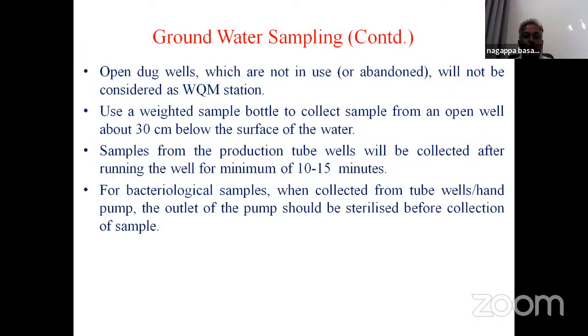Groundwater. If it is well water, a tube well, motor driven pump or hand pump in the village or community water supply, we have to switch on the pump for 10 to 15 minutes. We have to pump out the surface water in the borewell. After 15 minutes only, we have to collect a known quantity of sample in a clean container. After preserving the sample in a 4-degree ice box, bring it to the lab.